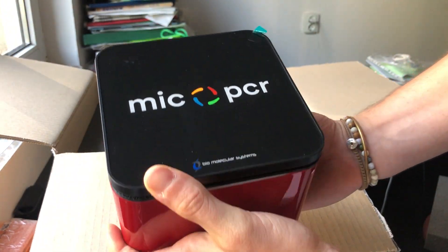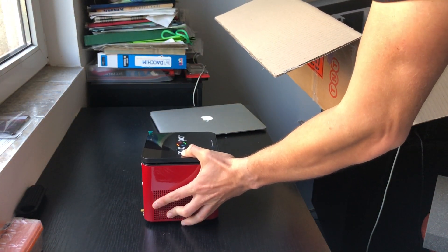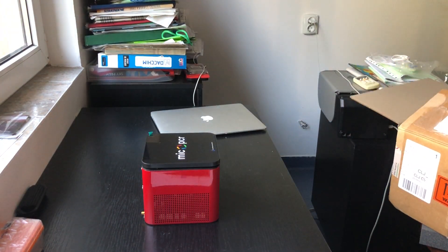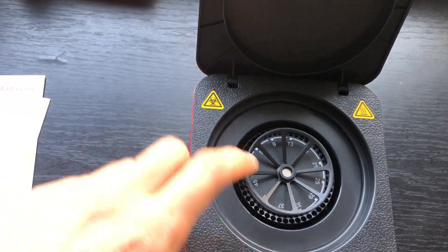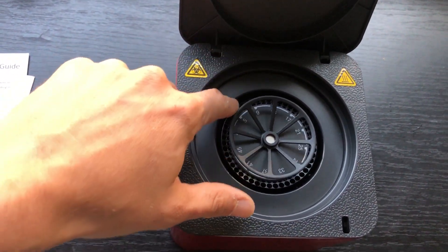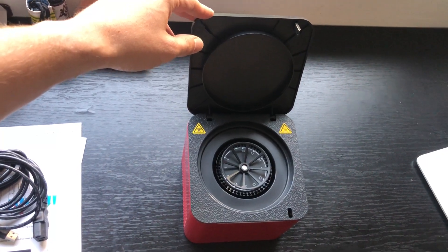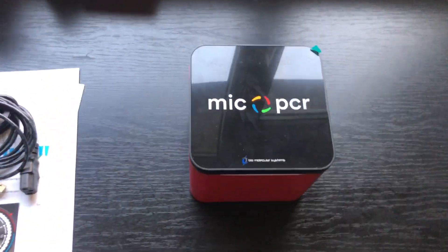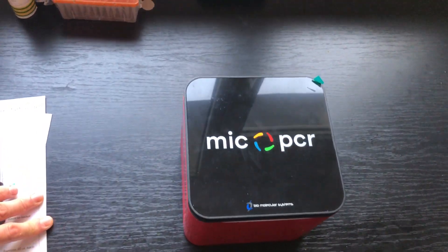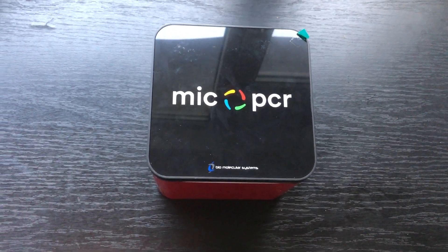Let me get the box out of the way so you can have a look at it. It has a rotor inside — you put the tubes in here. So it doesn't use regular plates; it uses a rotor with tubes. Hopefully this has been useful, and have a nice day!